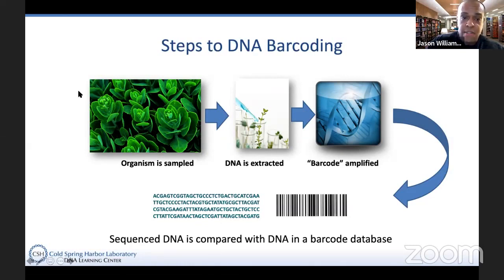Now, all of these wet lab steps, that's what we would call them, all of those first steps, if you're a bioinformatician, you probably aren't doing those yourselves. You really wait until you get the data, and then once you have the data, you can actually do something with it. So that's the part we are at. And really by the end of this, especially next episode, when you see those individual DNA sequences, they amount to a unique barcode for every species on the Earth.